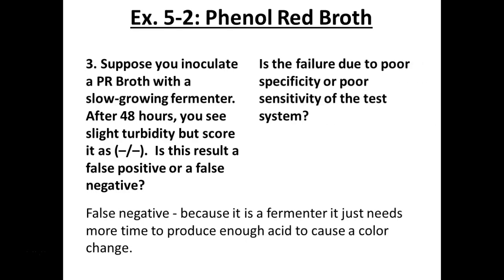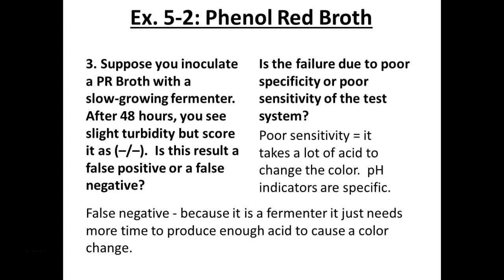Is this a problem with specificity of this test or sensitivity? Again, it's a color change. You have to get enough acid to produce that color change, right? So this would be a sensitivity issue.